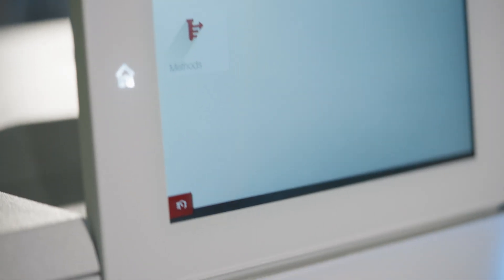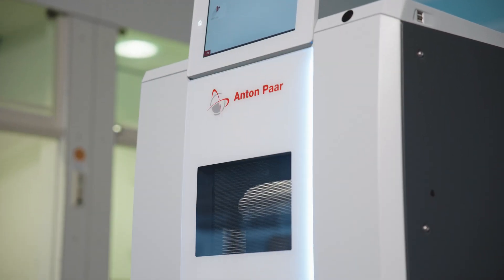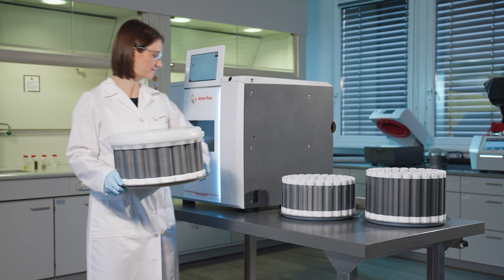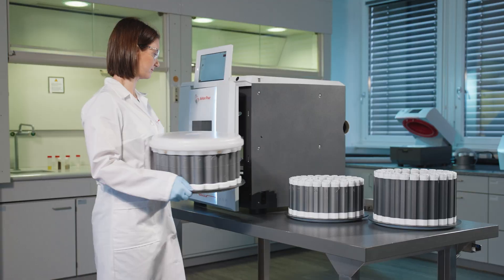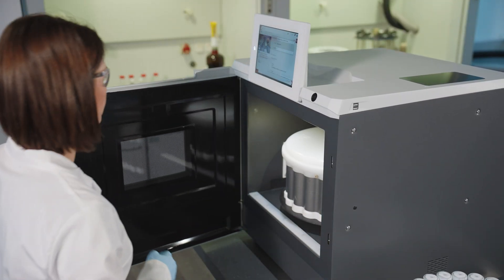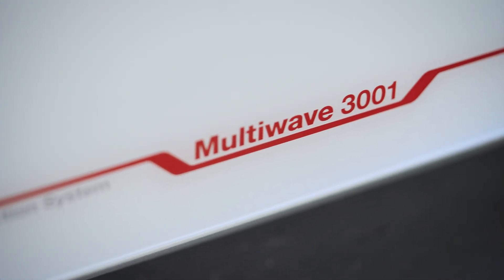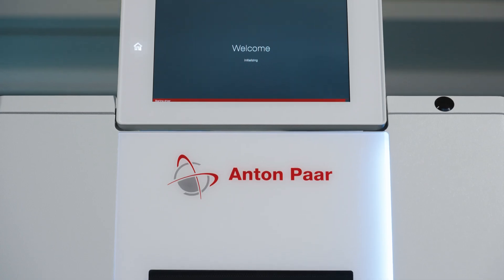Introducing the new sample preparation instruments by Anton Paar. MultiWave 5001 adapts to your lab's needs, whether for elemental analysis, synthesis, or extractions. MultiWave 3001 is the budget-friendly match for routine samples.